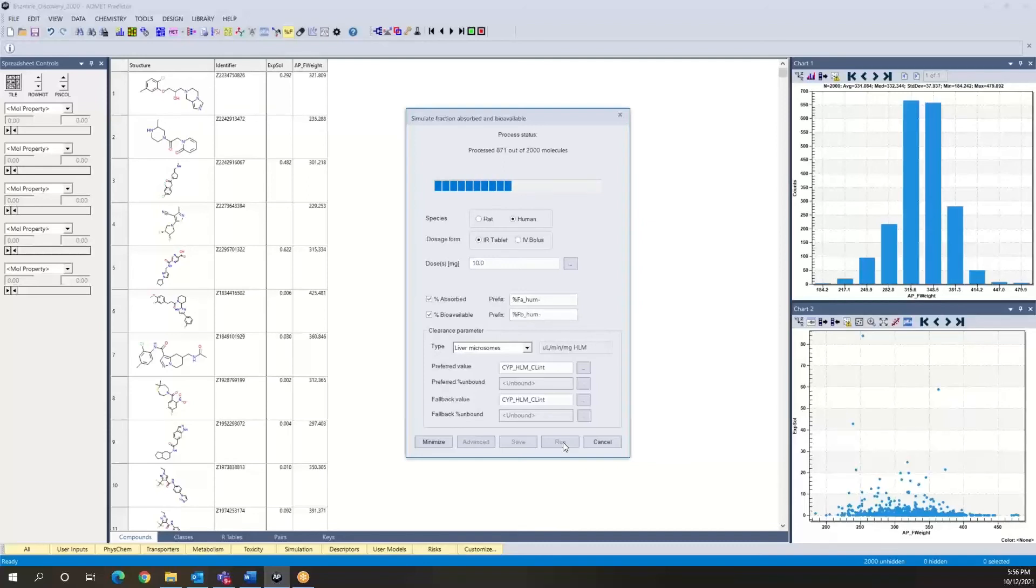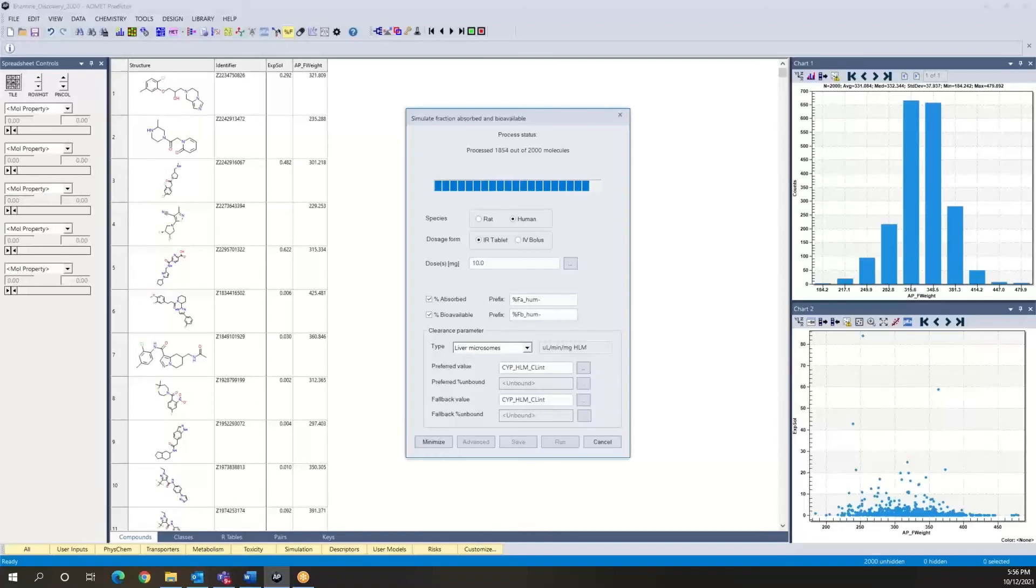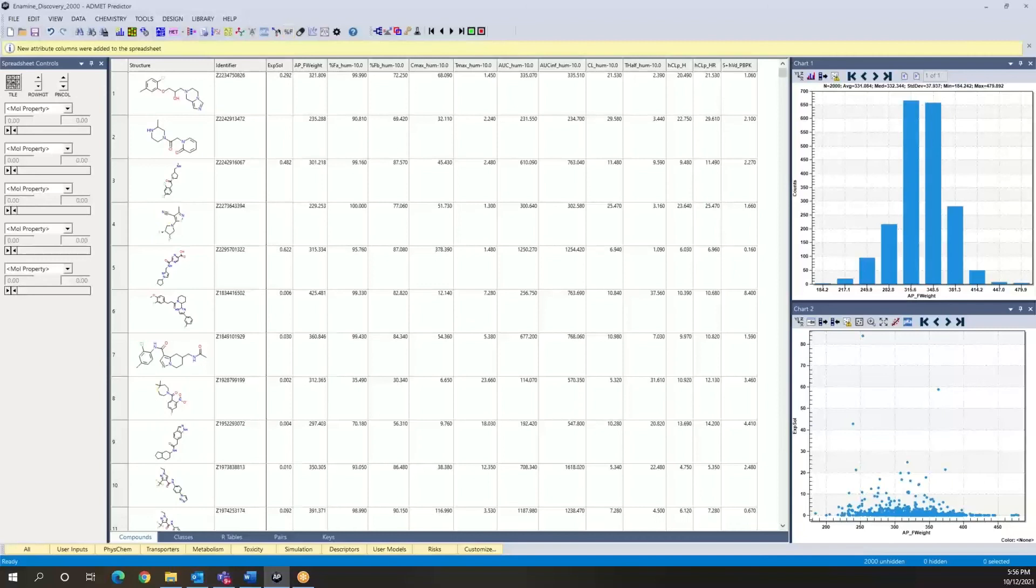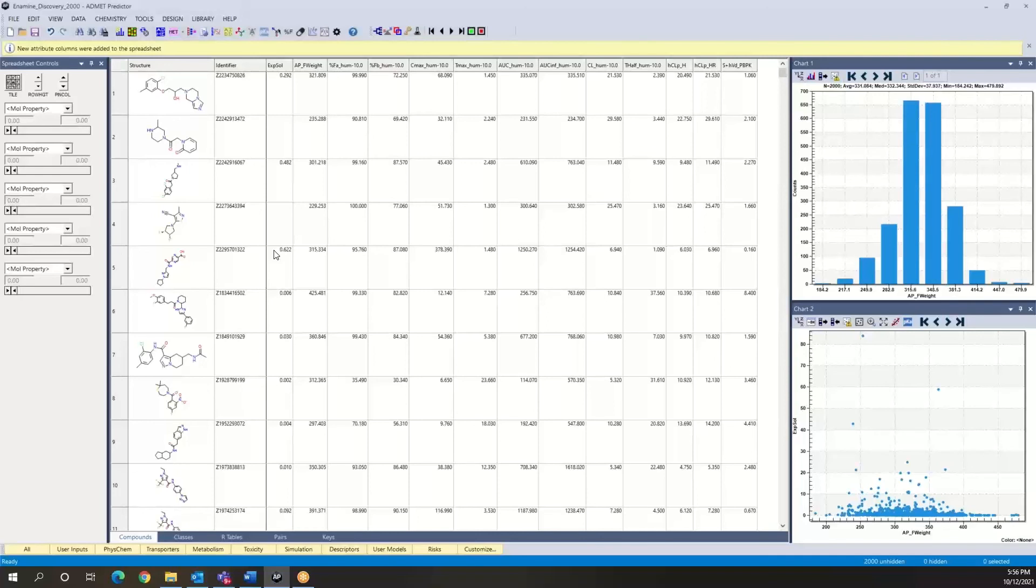So it's proceeding at about the same speed that we've had before. Again, the software is multi-threaded, so it goes rather quickly. And one of the things we noticed is that the software did not complain that we had missing values for the experimental solubility.